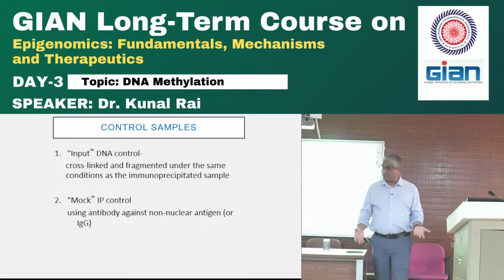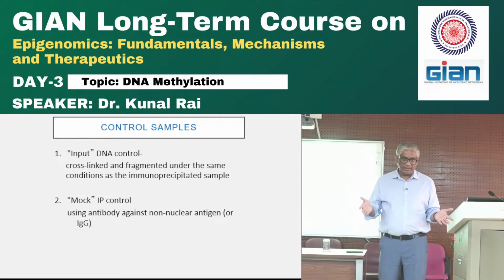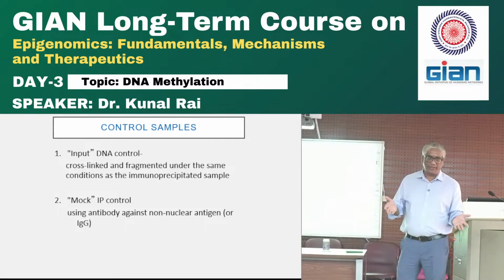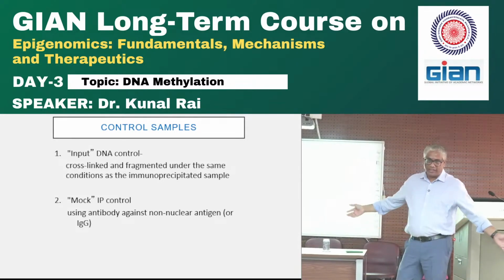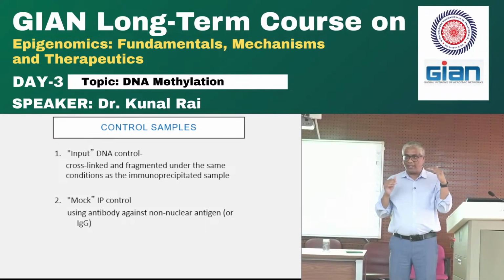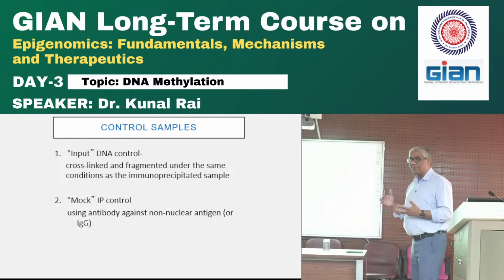She explained how antibodies work, right? Antibodies have a specificity to certain things. Antibodies have this other region, the heavy region. There are antibodies that are just secondary antibodies. They just bind to random things. So if I use a control antibody, and some region of the DNA just binds to the antibodies for no reason, that will come out. I can subtract that read out of my main experiment read to find where those reads came from. Does that make sense?